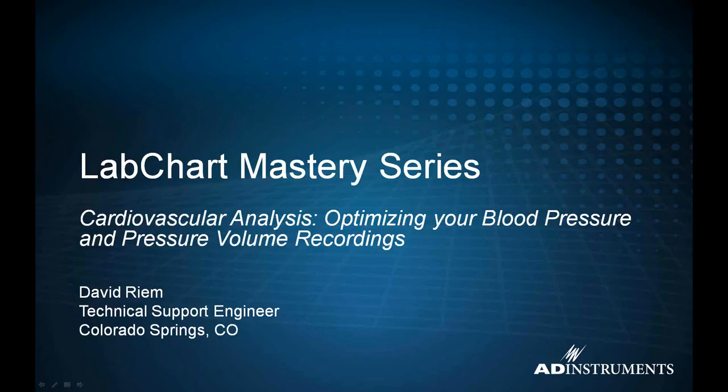Today we're going to cover cardiovascular analysis, optimizing your blood pressure and pressure volume recordings.